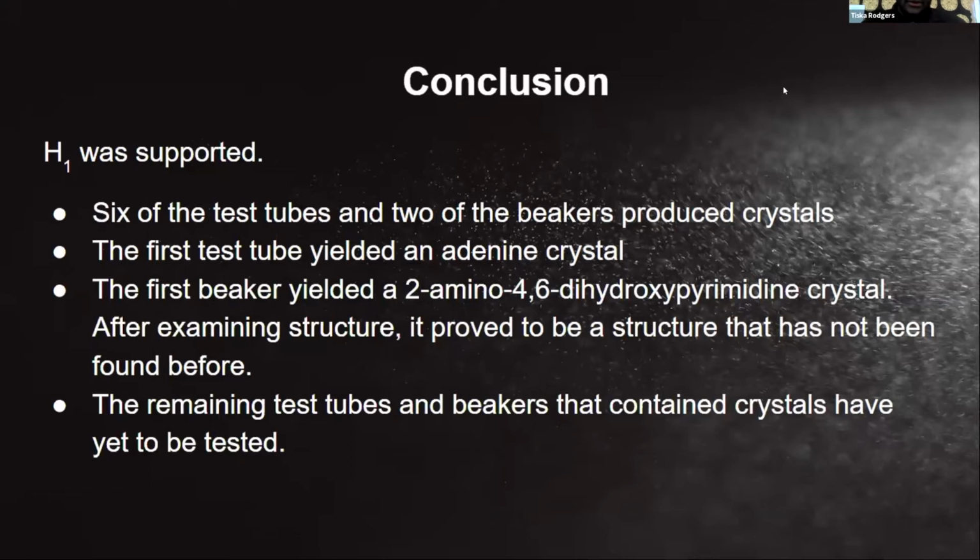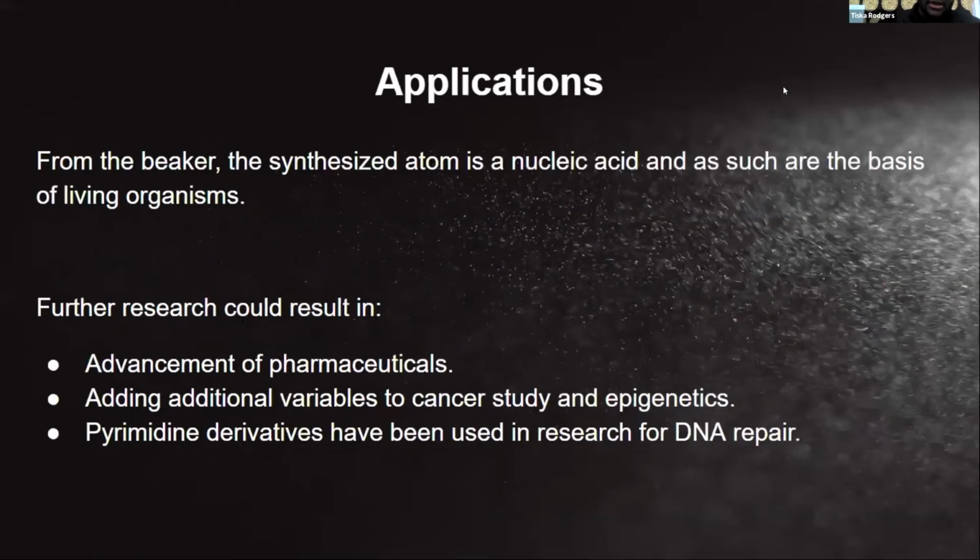Conclusively, our experiment is not yet finished, but this is what we have found so far. We have yielded 2-amino-4,6-dihydroxypyrimidine, which has no evidence so far, so it may be brand new, because there's no supported evidence of it existing. But we have other crystals that have yet to be tested, which we have not gotten to yet because we have not got back to our laboratory.